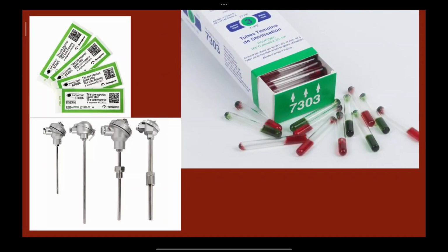Now we have the Brown's tubes which are used for checking the sterilization level inside the hot air oven. These are directly placed into the hot air oven and checked for the change of color. If the red color is changed to green, it indicates that the sterilization has happened. If the color does not change or any other color is appearing, then the sterilization has not happened. So that is the indicator of dry heat sterilization in a hot air oven.